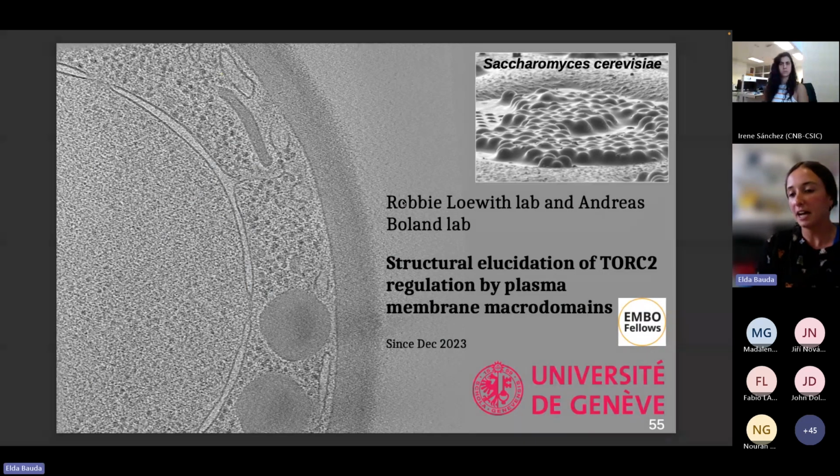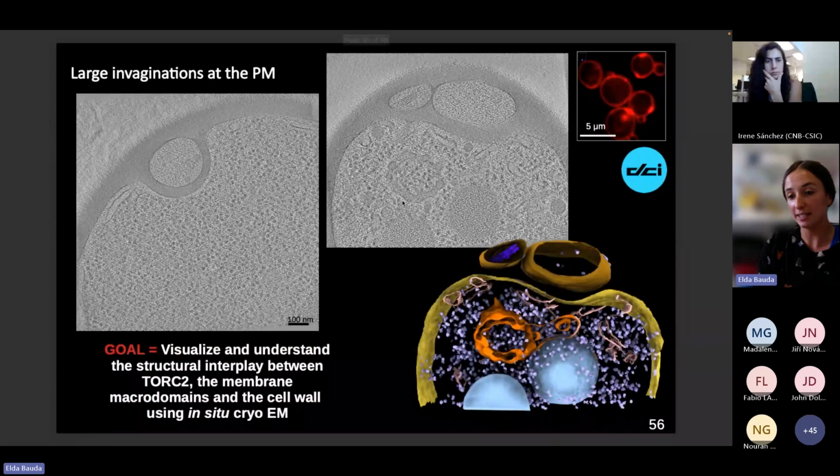So now, briefly before finishing this presentation, I would just like to say that I'm now at the University of Geneva, and I keep doing cryo-ET because I think it's a really great technique, but this time on yeast. And these budding yeast are quite a nice sample to work with as well. And we are now also interested in compartments, but I'm more interested in some plasma membrane compartments that are seen in yeast and are known to be involved in stress response.